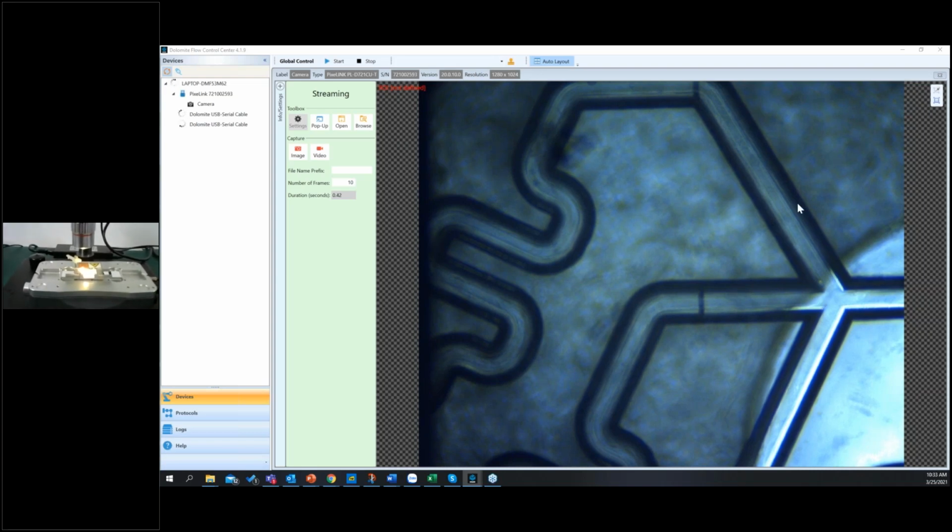The droplet phase and carrier phase will be mixed at the chip junction, and we can make droplets or cut the laminar stream between the 2 streams.